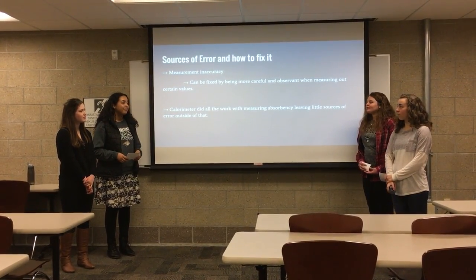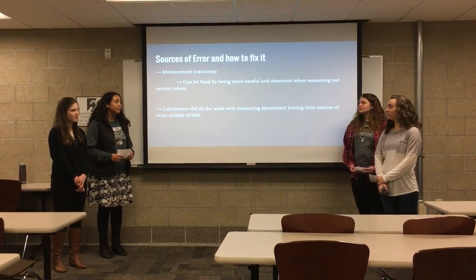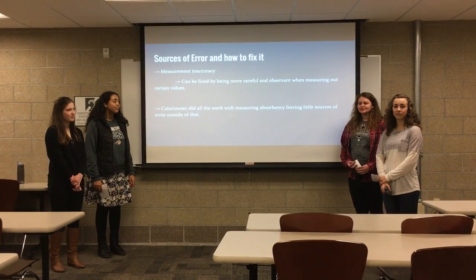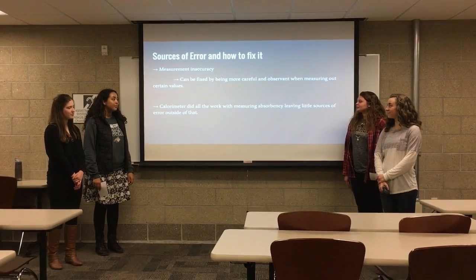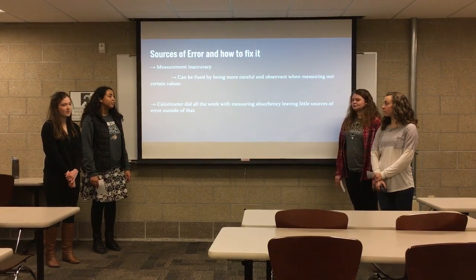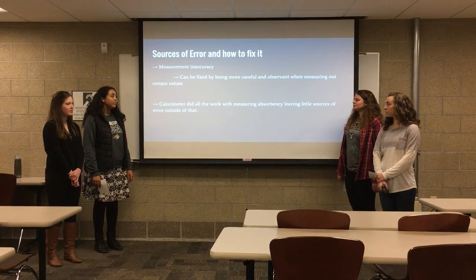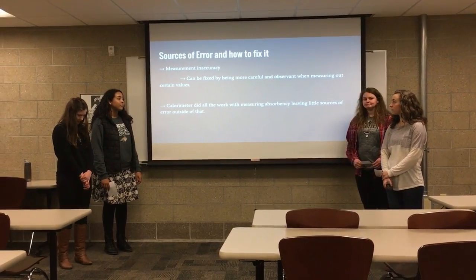The sources of error that we found were measurement inaccuracy, which can be fixed by using better tools more appropriate to get a more accurate measuring out of the certain values, and then the colorimeter did basically all of the work for us, and it found the absorbance of each solution for us, so we used the numbers that were cranked out by that machine.